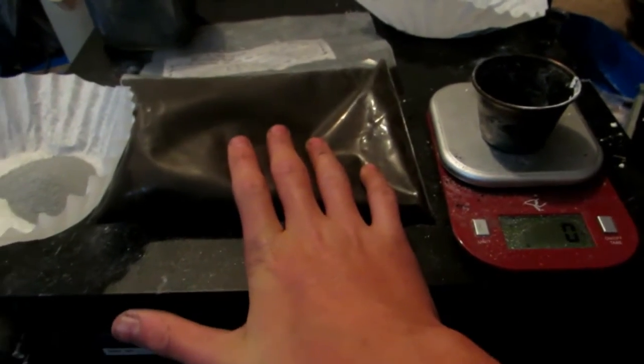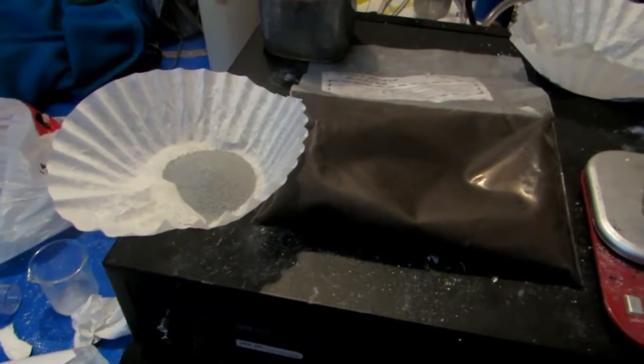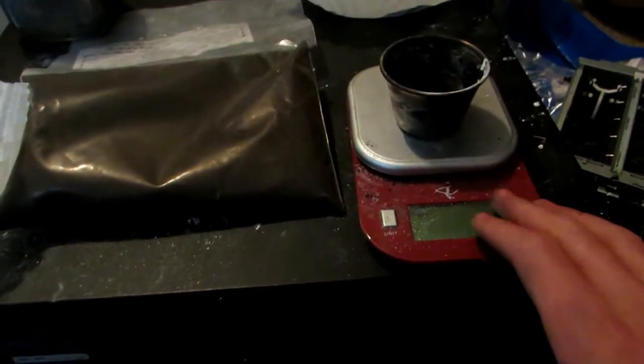So we multiply by 2.5 by however many grams of aluminum we're using. For 20 grams of aluminum, we will need 50 grams of manganese dioxide powder.